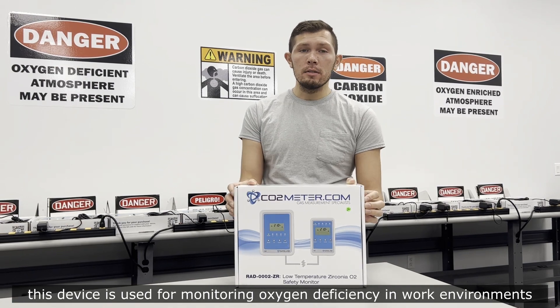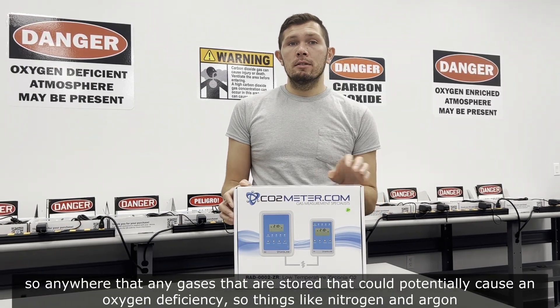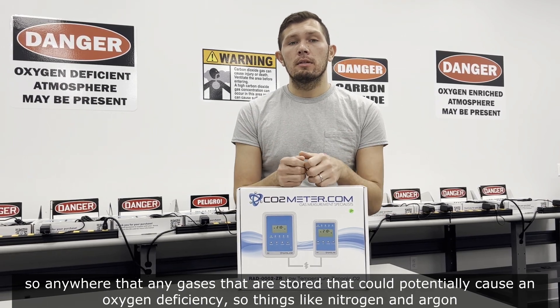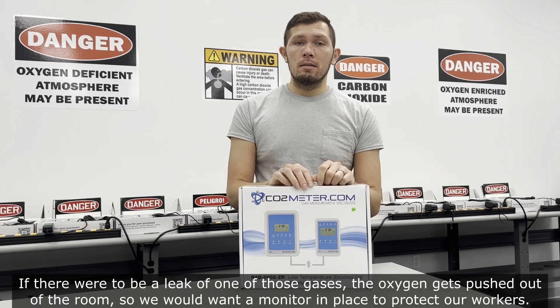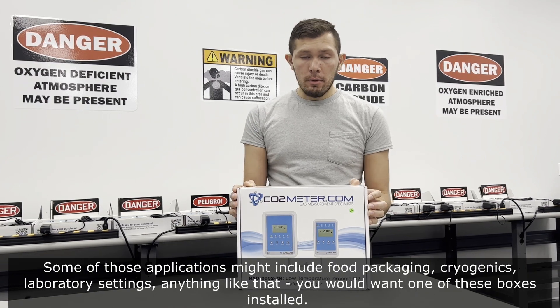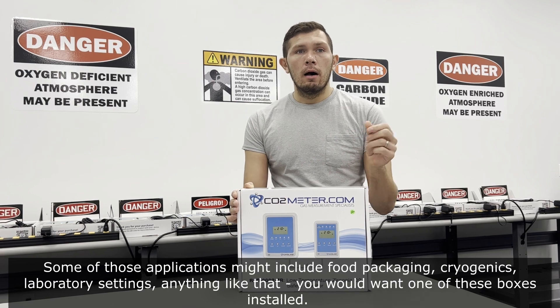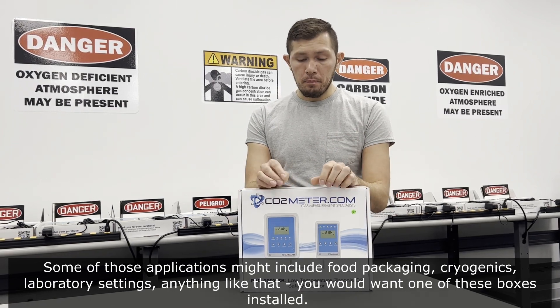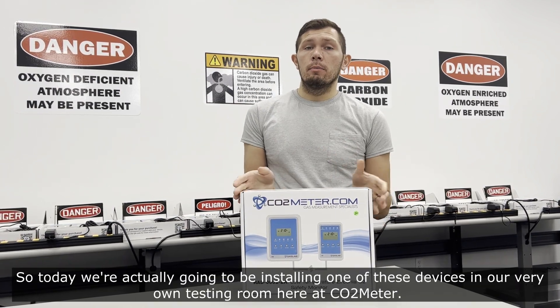This device is used for monitoring oxygen deficiency in work environments — anywhere that gases are stored that could potentially cause an oxygen deficiency. Things like nitrogen or argon: if there were to be a leak, the oxygen gets pushed out of the room. Applications might include food packaging, cryogenics, laboratory settings — anything like that.